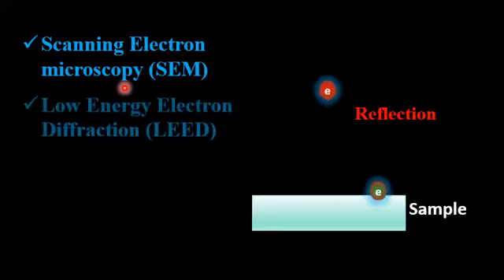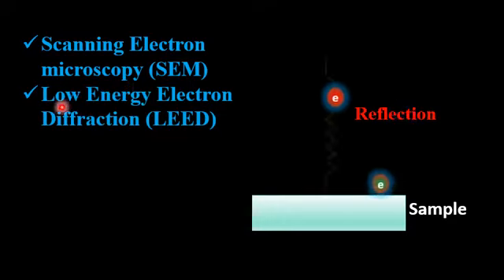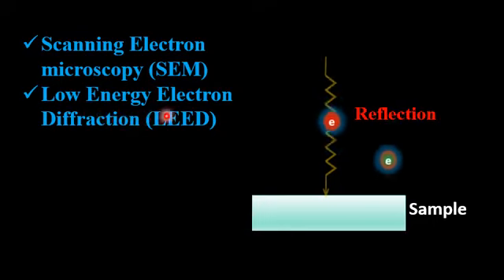Another important technique which is based on reflection of electrons is known as low energy electron diffraction.